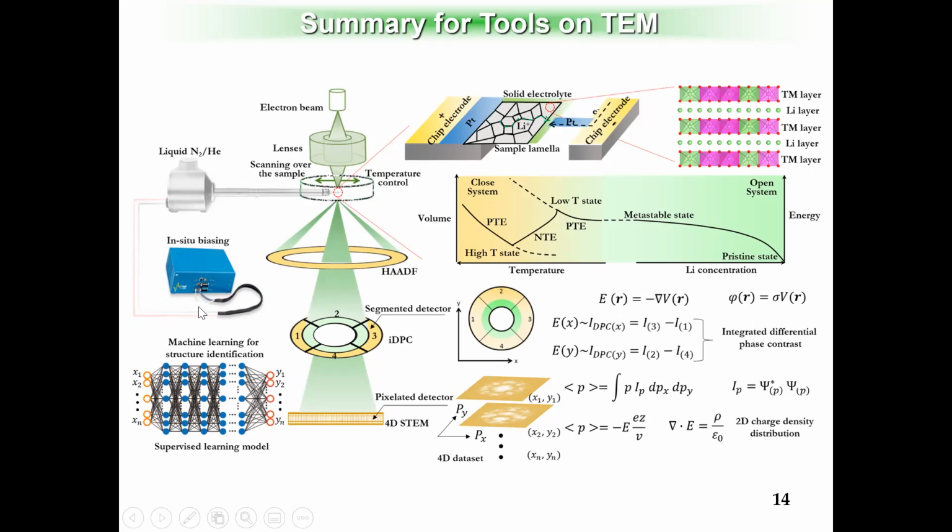We also want to enable some in situ biasing properties, because for a lot of battery studies or energy storage materials, you want to see under voltage biasing how the material behaves.